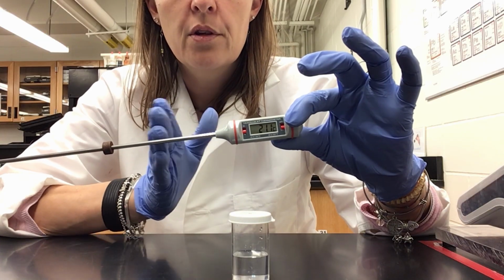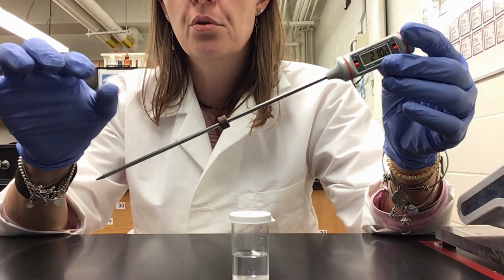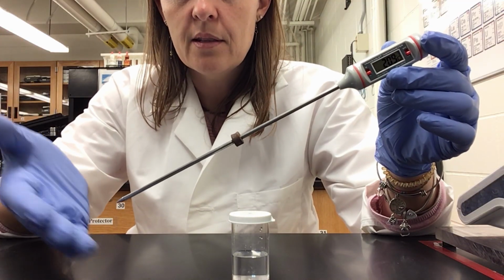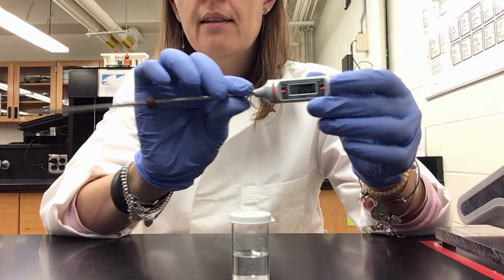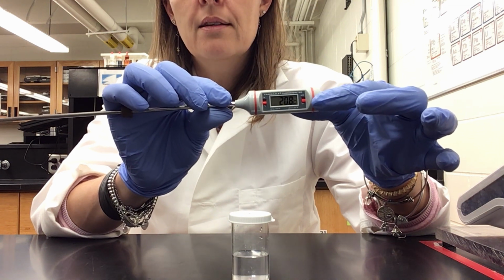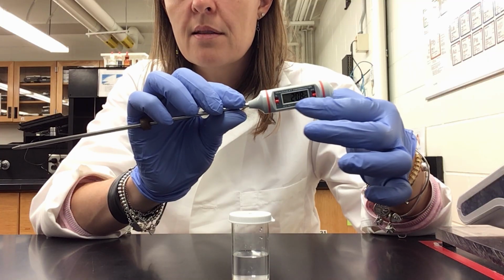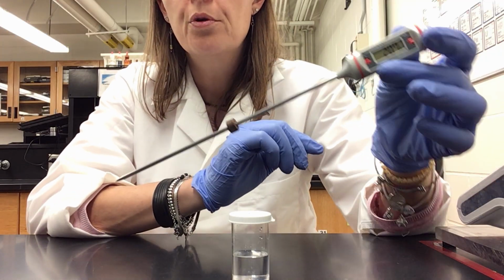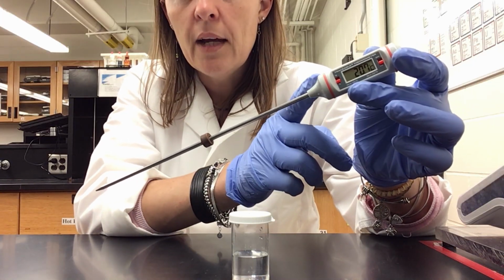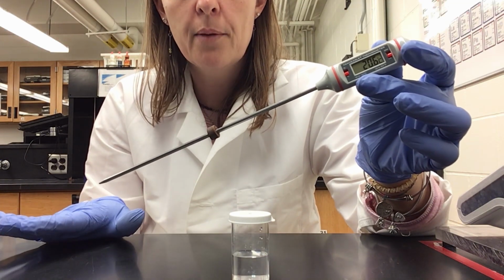But how do we know whether the thermometer is working properly? So what you will have to do is to put the tip of the thermometer in ice. You know that ice is 0 degrees Celsius, and therefore here it should display 0 degrees. If it doesn't, it means that the thermometer is not well calibrated, and therefore you need to take the difference into account. So let's say that if I put this into ice and this measures 2 degrees, then I will have to subtract these 2 degrees from my measures of my samples, okay?